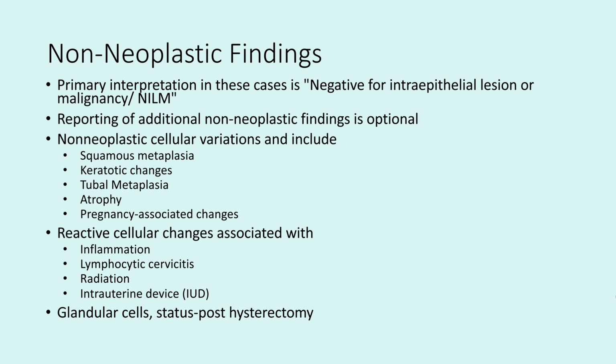So there's lots of different categories. The first are cellular variations and then reactive changes, glandular cells post-hysterectomy. We're going to go through each of these on their own slide.